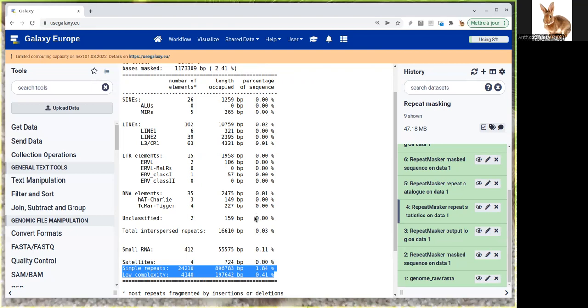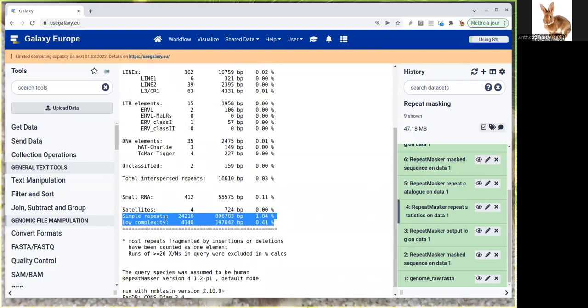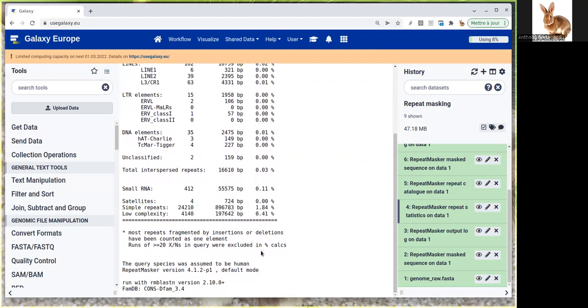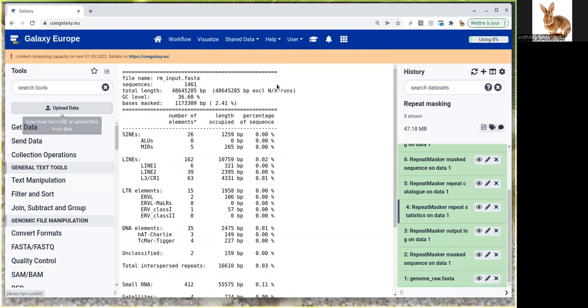Probably if we had selected a species closer to our species, we would have more repeated elements in other categories. These ones are very generic and found in any genome. So 2.41% is quite low, which is okay for annotation later on.